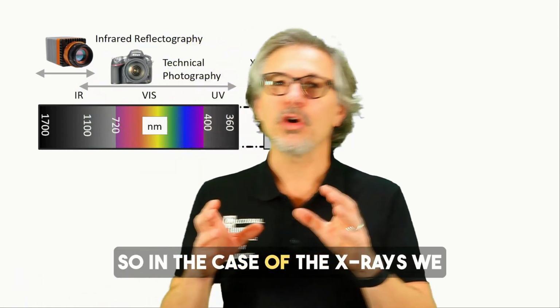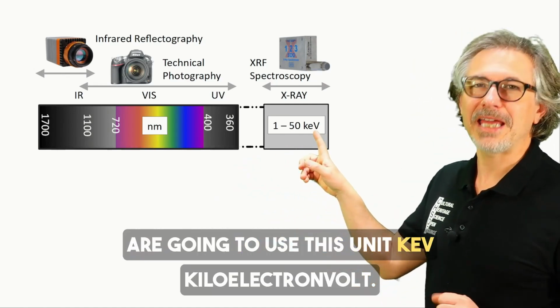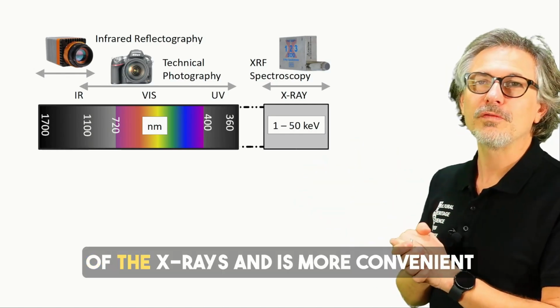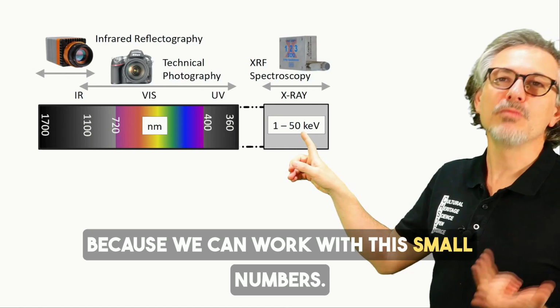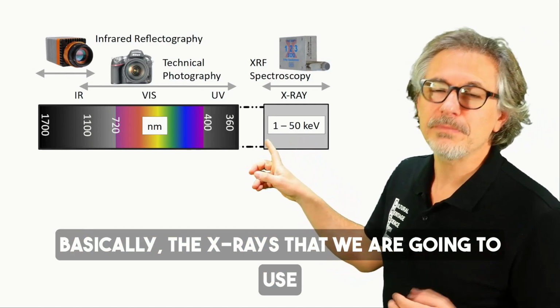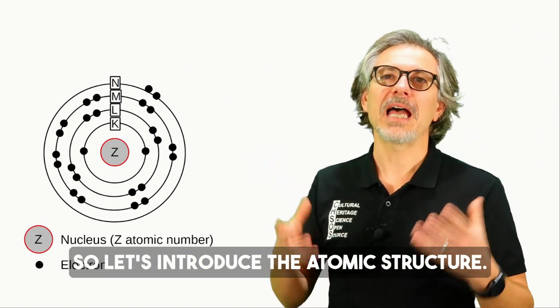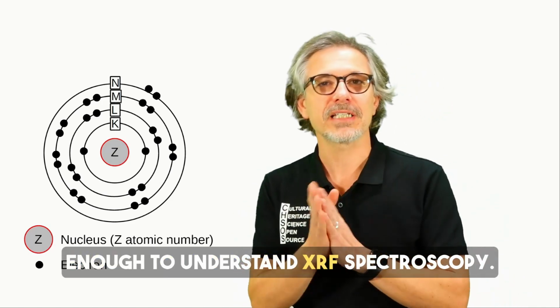In the case of X-rays, we use keV, kiloelectron volt. This is a unit to indicate the energy of the X-rays, and it is more convenient because we can work with small numbers. Basically, the X-rays that we are going to use for XRF spectroscopy are between 1 keV and 50 keV.